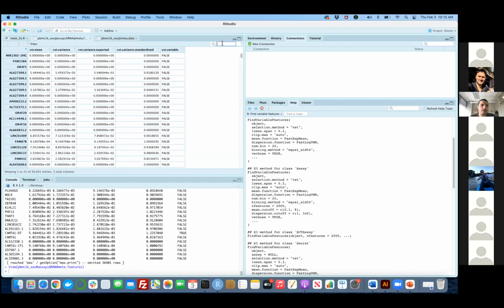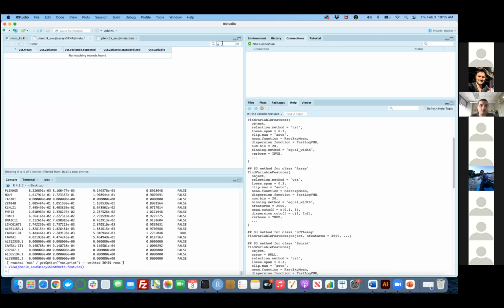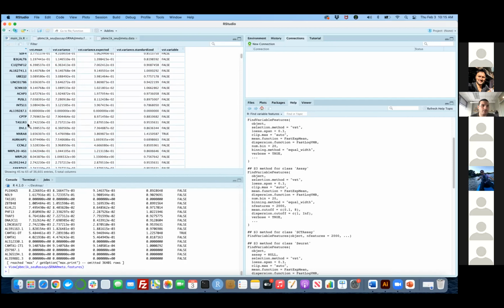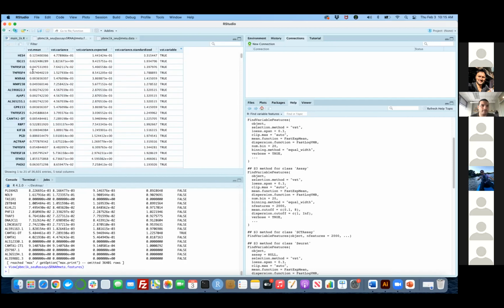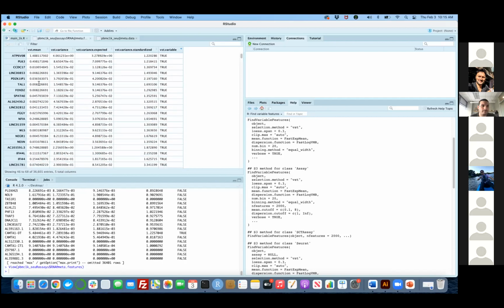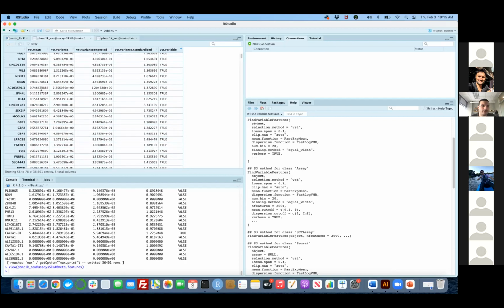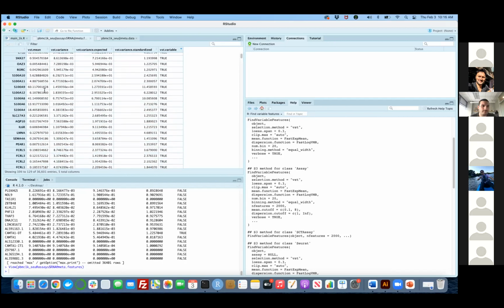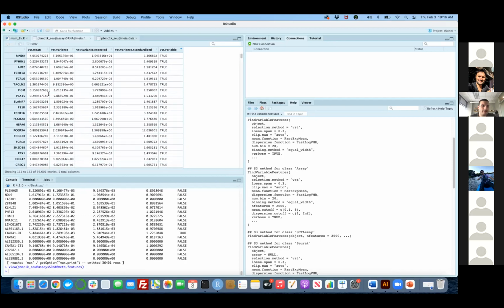So you can just click on any kind of gene that you can think about. Let's say granulysin, which is really important for NK cells and T cells. Not picking up. Okay, because it's not here. I have to find it myself. Should be somewhere around here. I guess I can choose it now. Should be somewhere around here though. Basically, you can actually see if the gene is here or not.